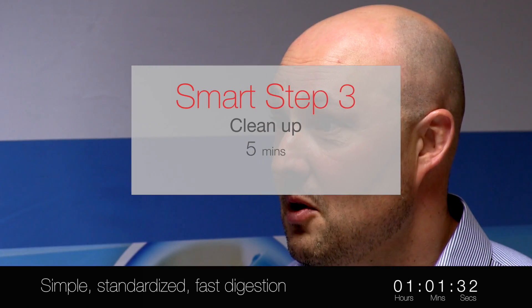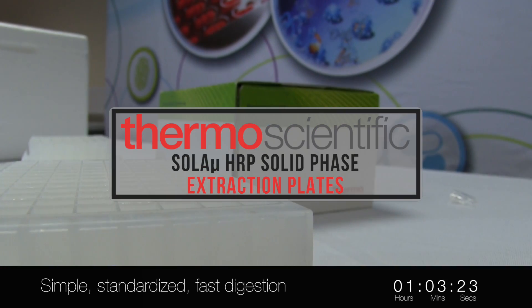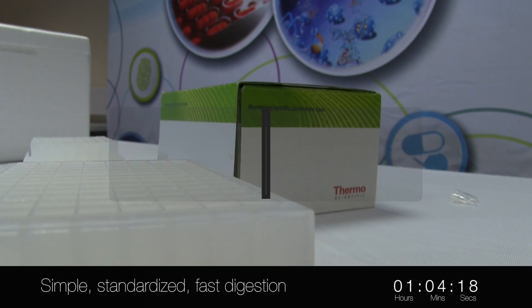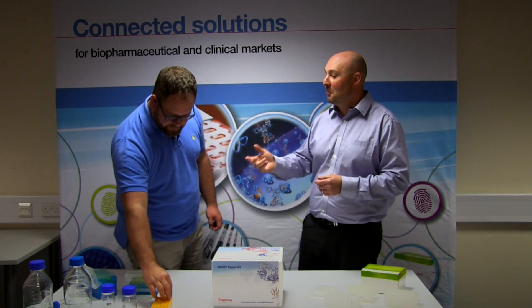You might need to do a centrifugation step or an SPE step with the Oasis micro-SPE to clean up your sample if it's from a complex matrix such as plasma. And that's it. That's amazingly quicker. So how do you compare that to what you just did? Well, it's a lot easier and a lot less chance for making a mistake. Obviously I'm infallible so I wouldn't have made any, but anyone else would. Most definitely the Smart one.